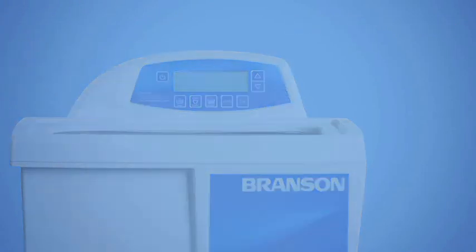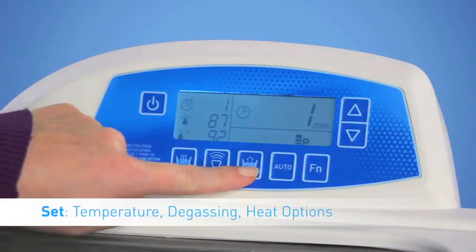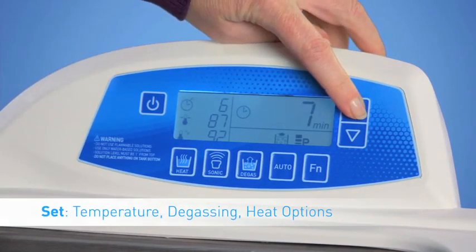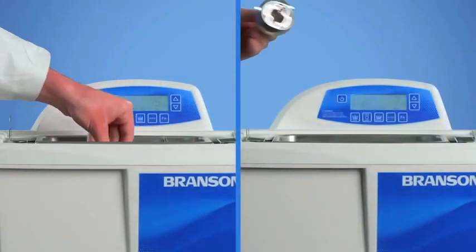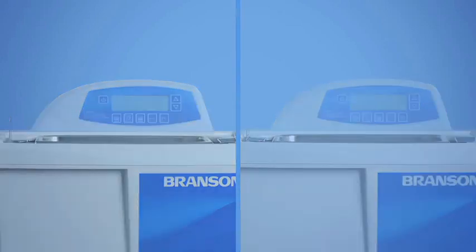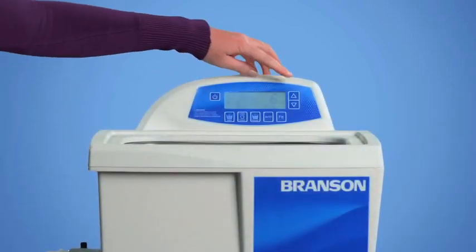Depending on the CPX series, you'll notice simple digital controls that range from temperature setting to degas processing to heating. From the laboratory to the workshop, the new CPX series offers the right settings for the right job.